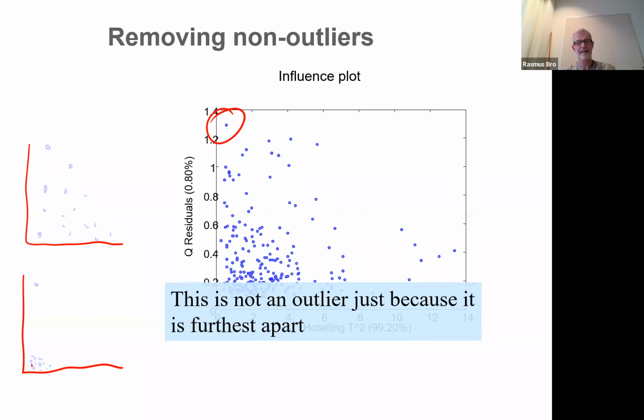And when I say explain, it's not saying, hey, the Hotelling's T-squared was 5 times higher than all the other ones. No, it means going back to the domain knowledge. Sample 5 had a high Hotelling's T-squared, and looking at the loadings and the contribution plot, we see that it's because it has much higher humidity, and that's a problem because blah, blah, blah. And from that domain insight, you're going to find the solution to what you want to do with the outliers. So don't remove outliers just because you don't like them.